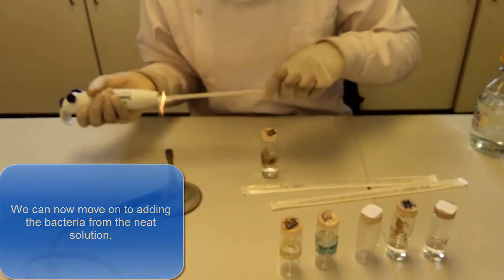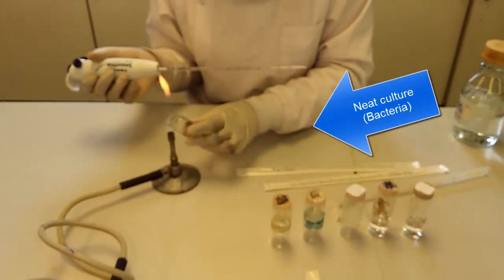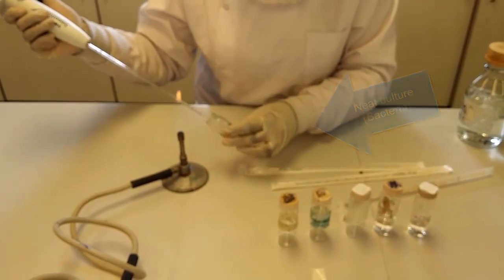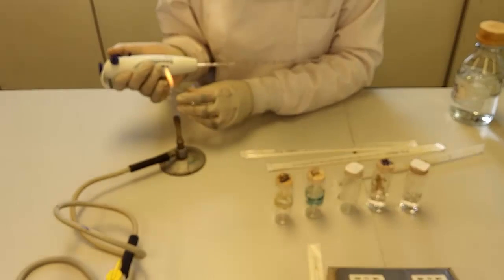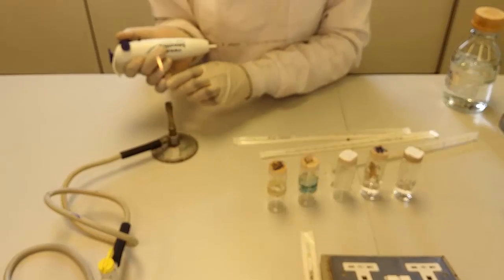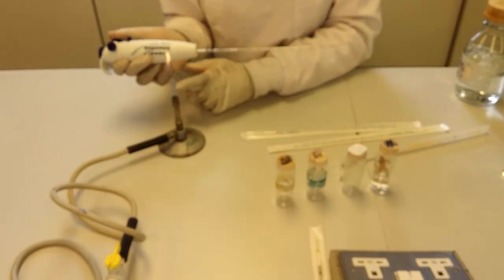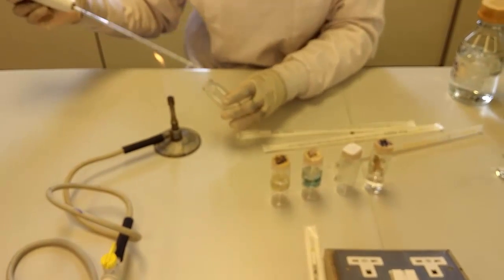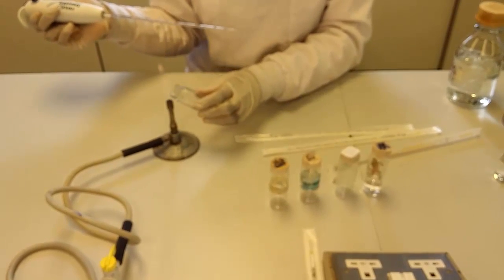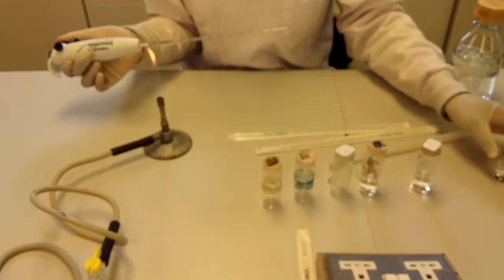The first tube contains 9 mL of water and 1 mL of the neat culture. This will be 10 to the minus 1. The second tube contains 9 mL of water and 1 mL of the previous dilution. This will be 10 to the minus 2. Continue this process until all 5 dilutions are made.